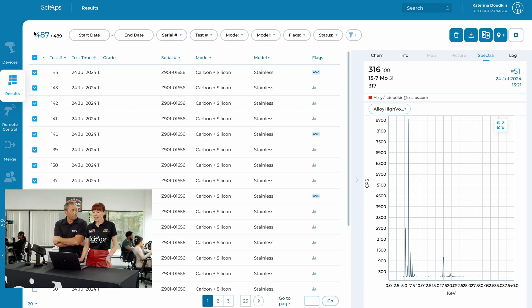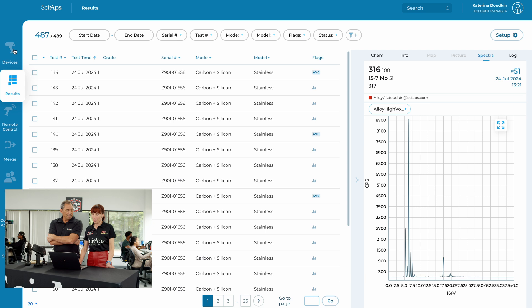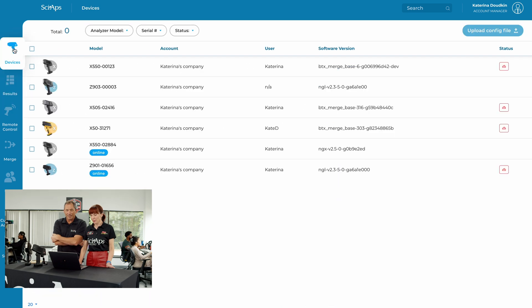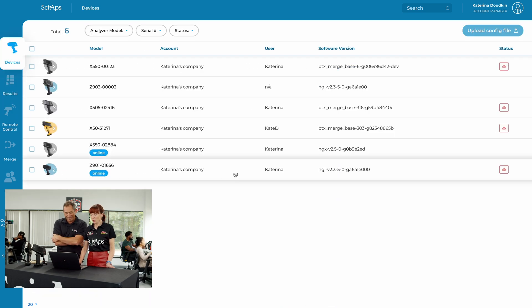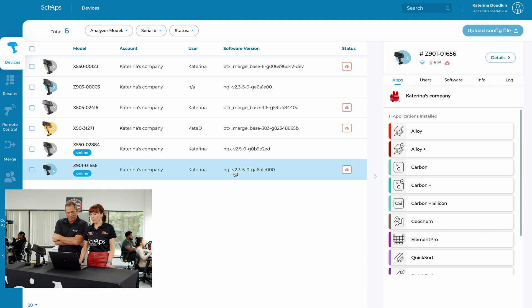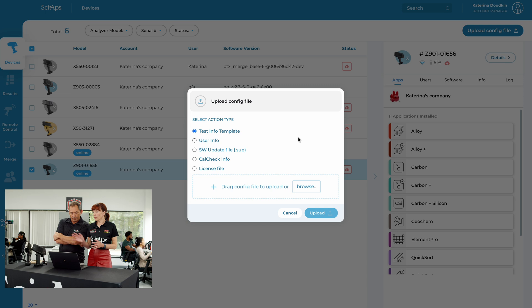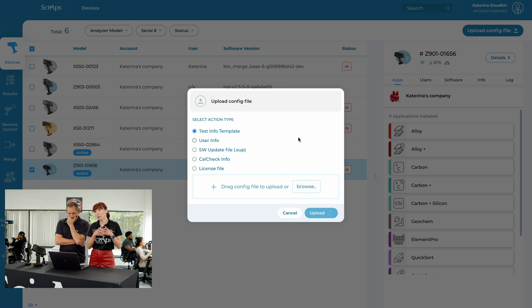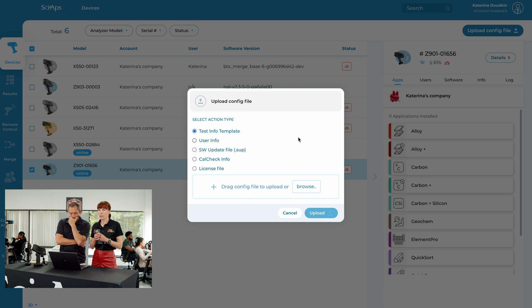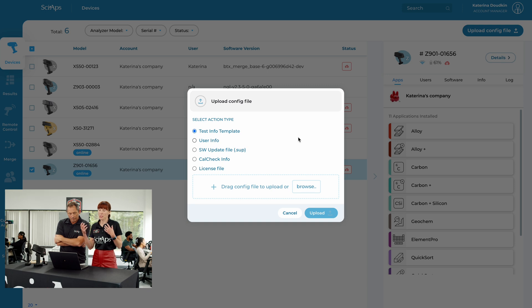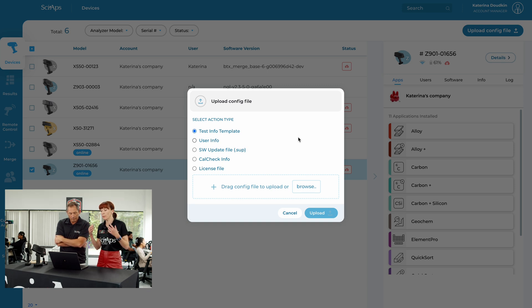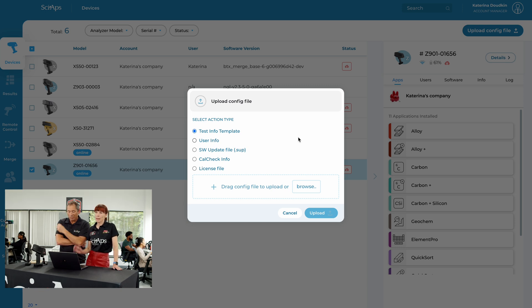Do you have anything else you need to? Yeah. I just want to talk a little bit. There's always something. It's always something. And I know, but I want to show capability of the software update. So what you could do. Oh, right. You could choose what to upload. So we could push configuration to these analyzers. We not only could push software updates, but we also could push some other configuration files. For example, if you want to change the license, you could do it. If you want to add some specific user information, because we support advanced user management, you could push user configuration files that will be sent immediately to analyzer.